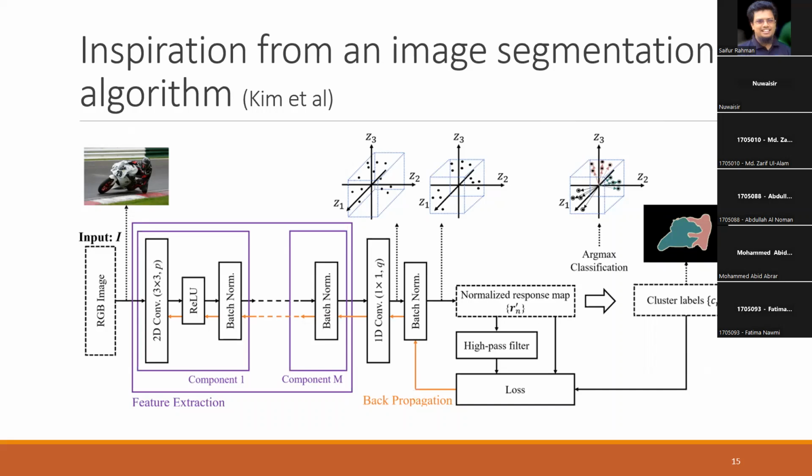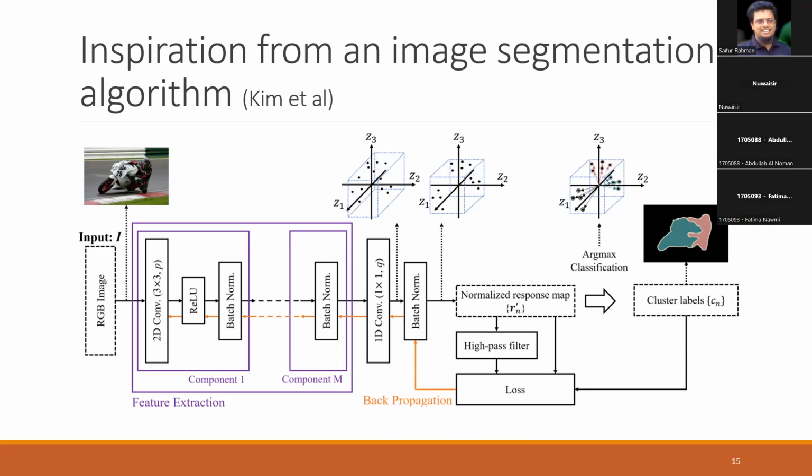That is, each pixel in the image is segmented into a group that identifies an object. We can model our problem into this by thinking of the pixels of the images as different spots and identify different regions in the tissues using an existing image segmentation algorithm.